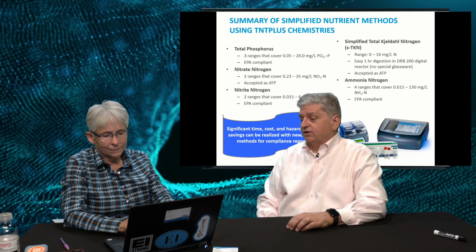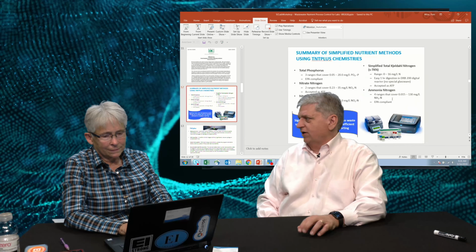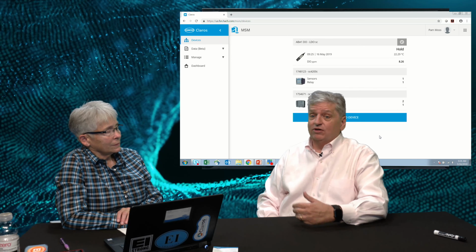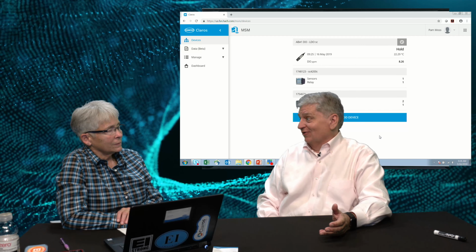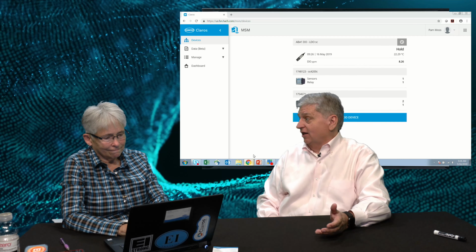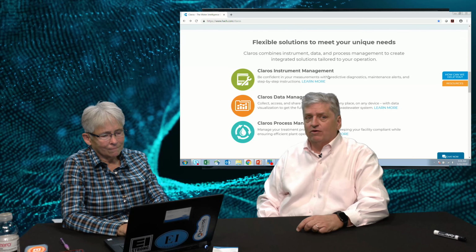but they need dedicated personnel to keep these online analyzers calibrated, maintained, so they do give us the accurate information. So as they're building their culture, not only their biological culture, but their workflow culture at the plant, it's a great stepping stone to full automation using these online analyzers to control the biological nutrient removal at their plant.